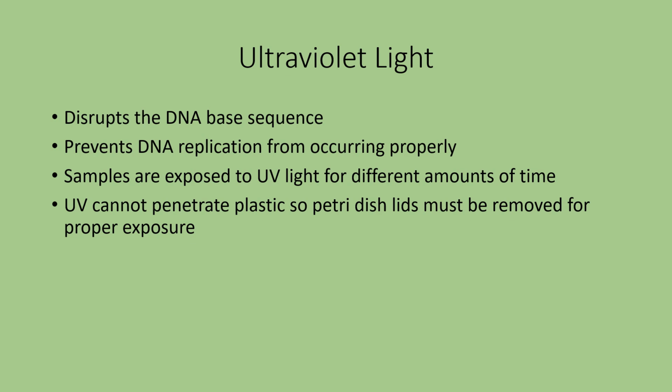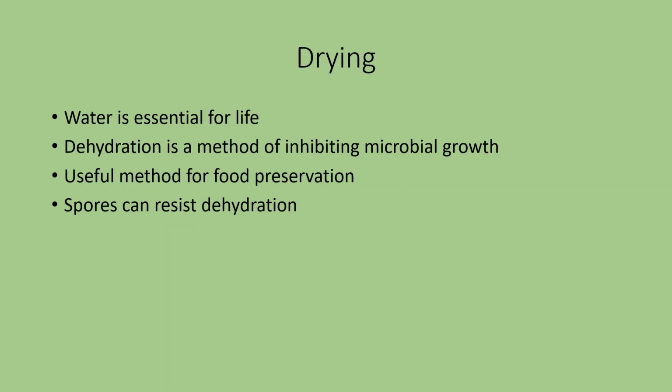So for this experiment anyway, you are going to inoculate plates with various bacteria. As I mentioned earlier, you will have to remove the lid during the exposure time to the UV, and you're going to have different exposure times as described in the experiment. And then you'll incubate the plates and see basically whether or not the bacteria grow or not.